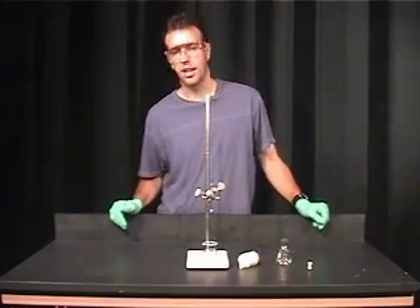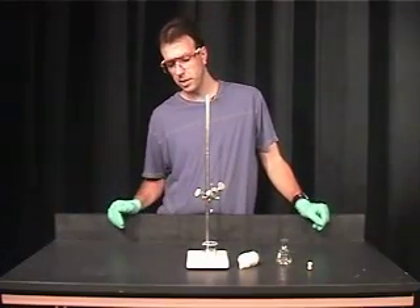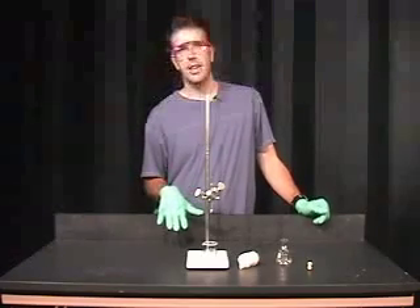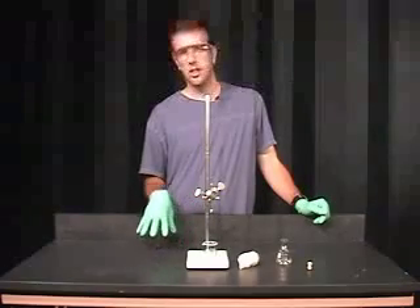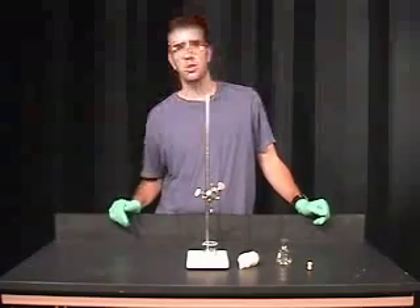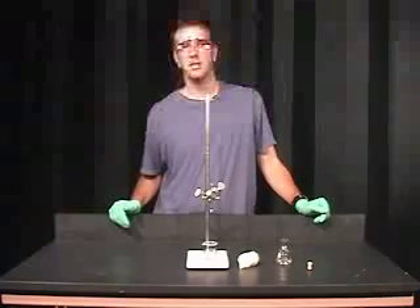I'm simply collecting this in a beaker, but you will be adding this directly to a polarimetry tube. Once you have added it to your polarimetry tube, you can take this to your lab instructor or your lab intern and measure the optical rotation of limonene.